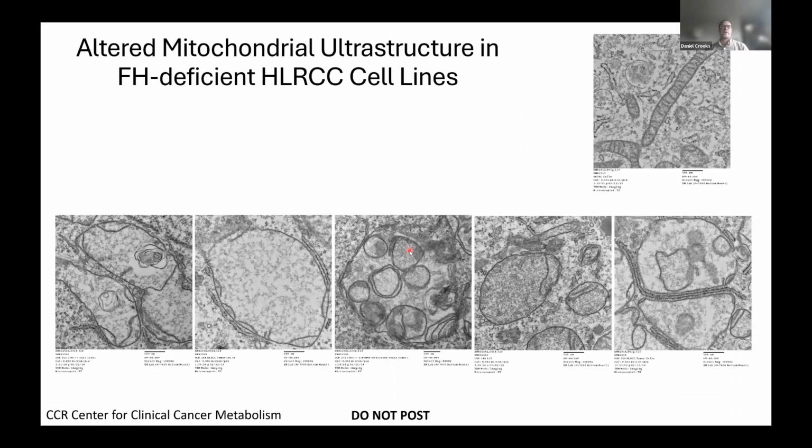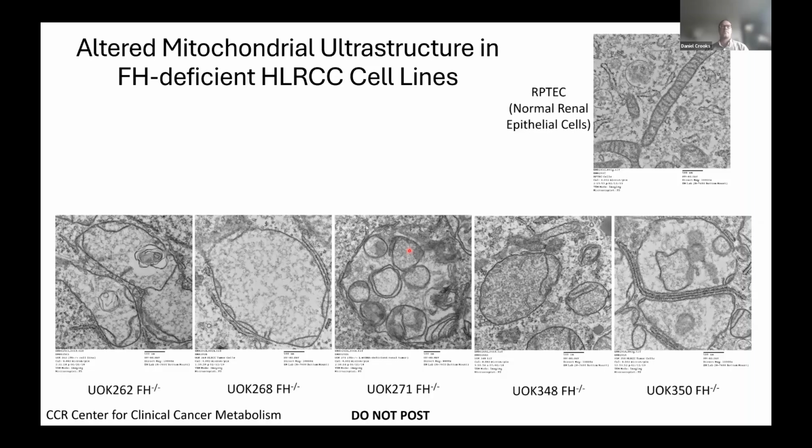These are some mitochondria from the cell lines that we have, which I won't go into too much detail, but you can see, again, disrupted structures. Here we have cristae that are very, very malformed, a lot of open space and swelling. I really don't even know what's going on with the cristae in this cell line. But in general, problems with the mitochondria, but they are not absent.